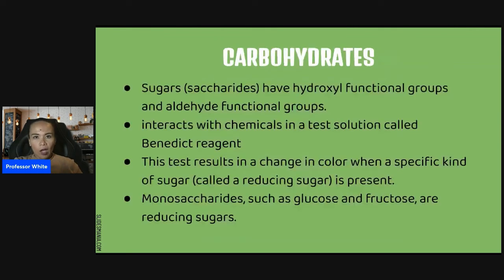So carbohydrates, aka your sugars, your saccharides, have hydroxyl functional groups and aldehyde functional groups. And the aldehyde group of saccharides interacts with chemicals in a test solution called Benedict reagent. So in the lab, you will use this reagent to test for carbohydrates.